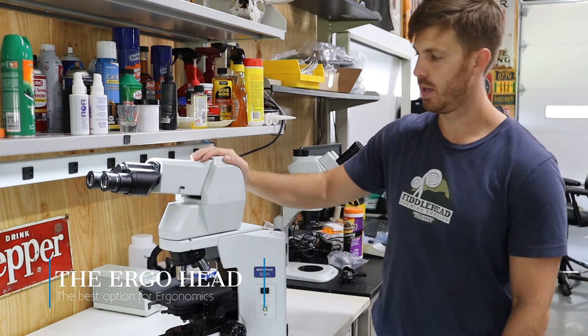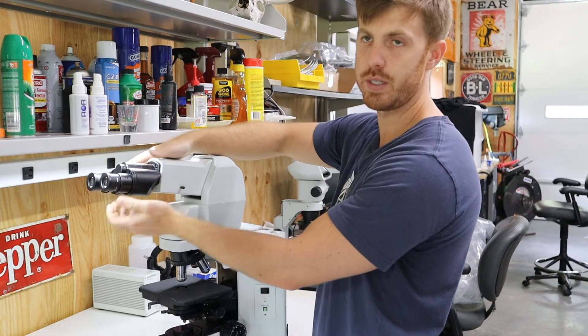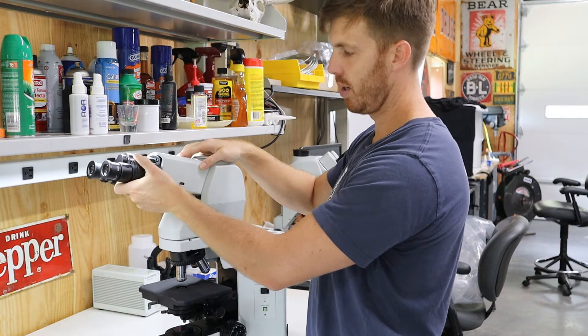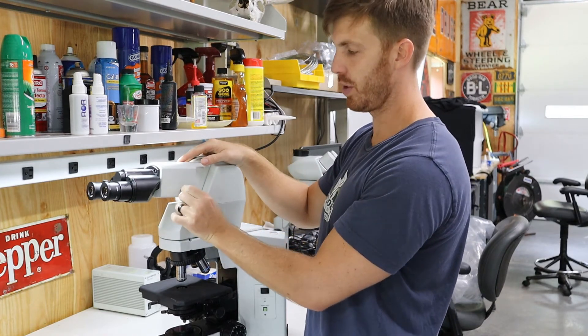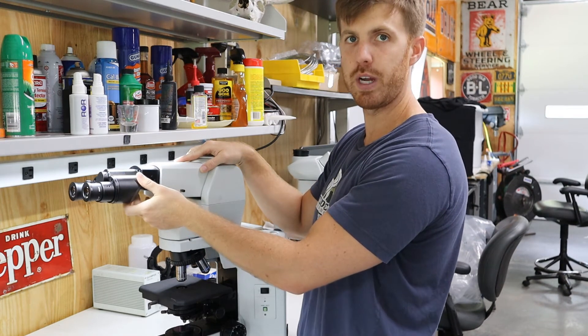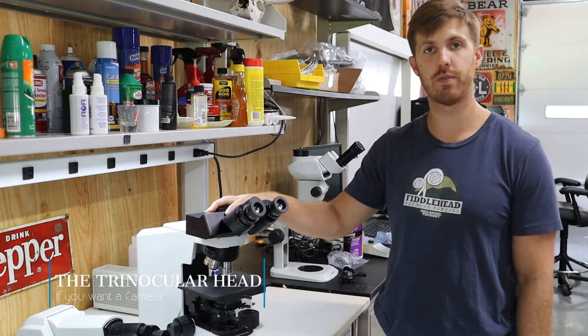Next, we're going to show you the tilting telescoping head from Olympus. Everything works the exact same way — distance between the eyepieces, same diopter tube. This one tilts up and down, but what's nice about this head is you can loosen this screw and extend it so you can sit further back in your chair. It's more ergonomic.